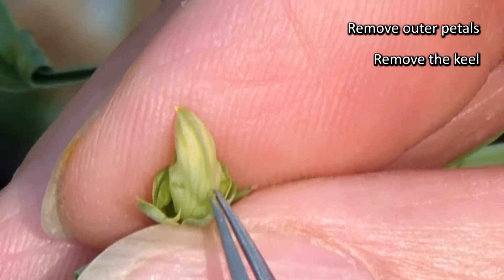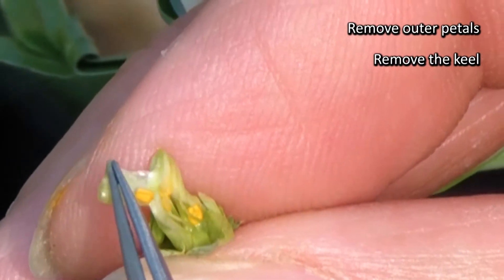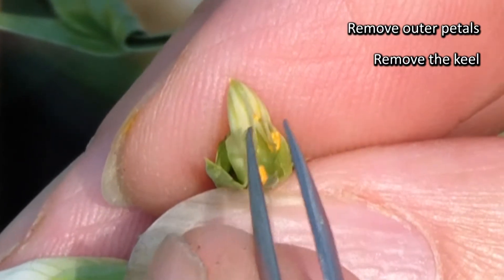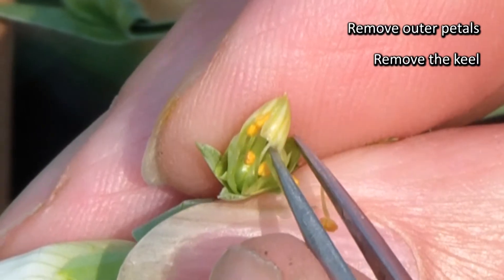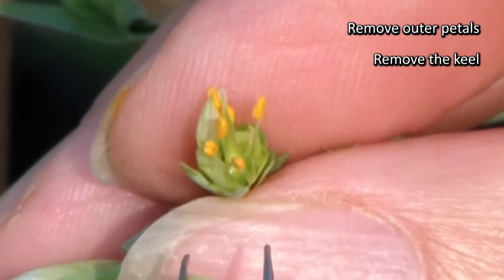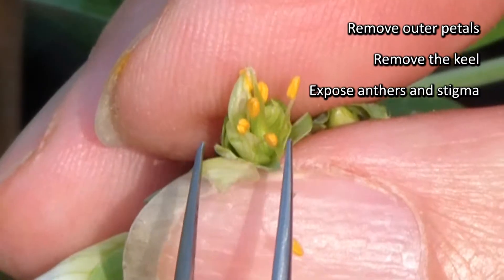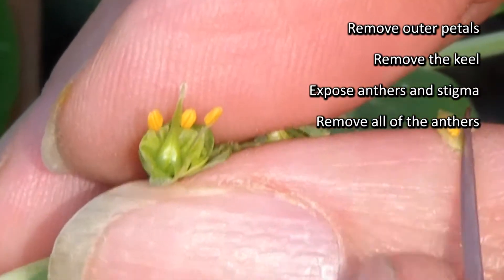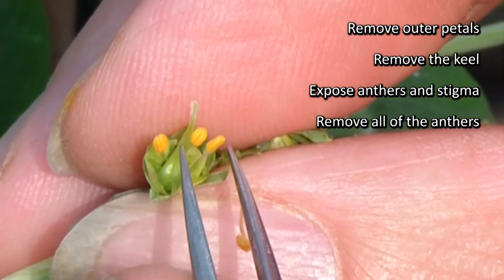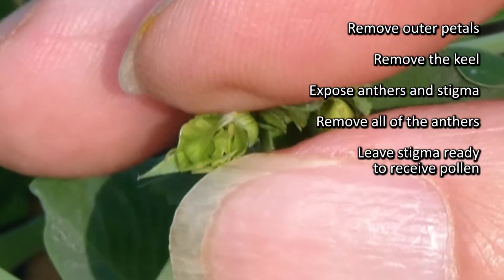You go in at the base of the keel, just going in without taking any of the other structures out. Take a few of the anthers — you can see the remaining anthers and the stigmatic surface in the flower still there. Take off the remaining anthers, and there's the stigmatic surface ready to receive pollen.